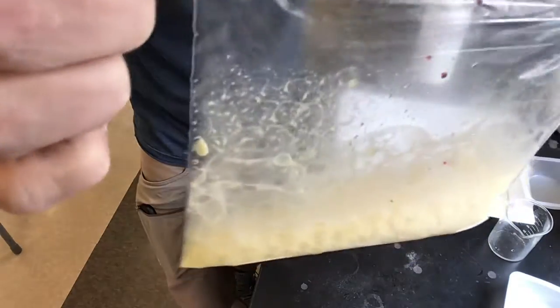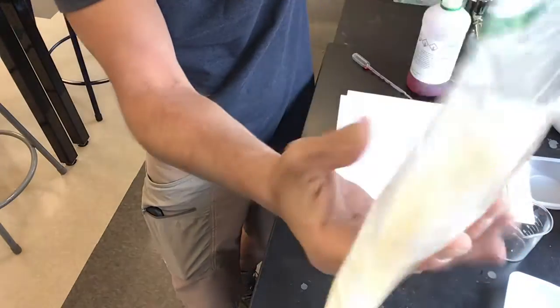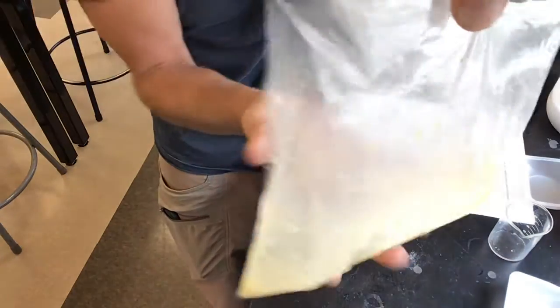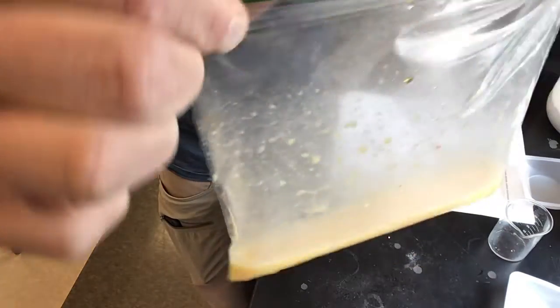Go ahead and make observations. I'm shaking up the bag. You probably noticed that the red indicator solution went yellow. You probably also noticed the fizzing, and that fizzing means that there's a formation of gas.